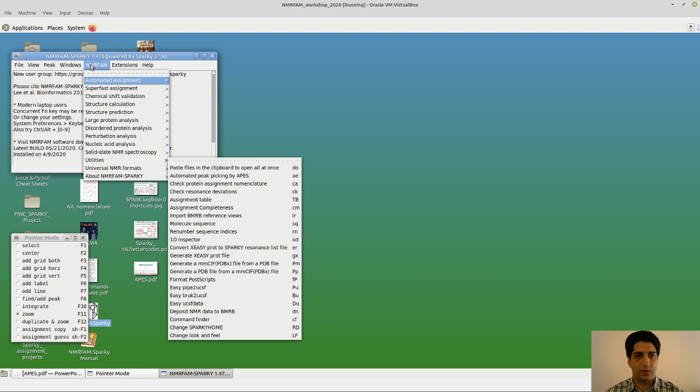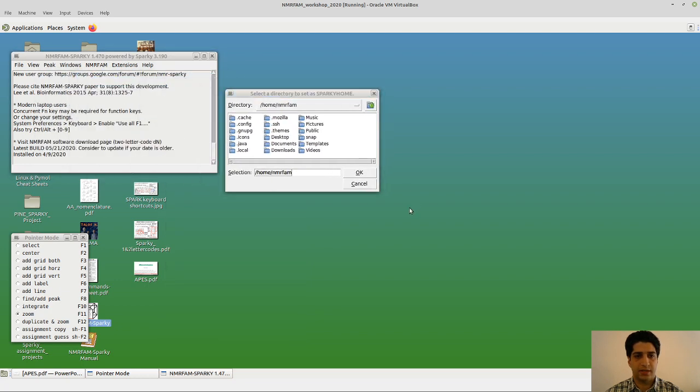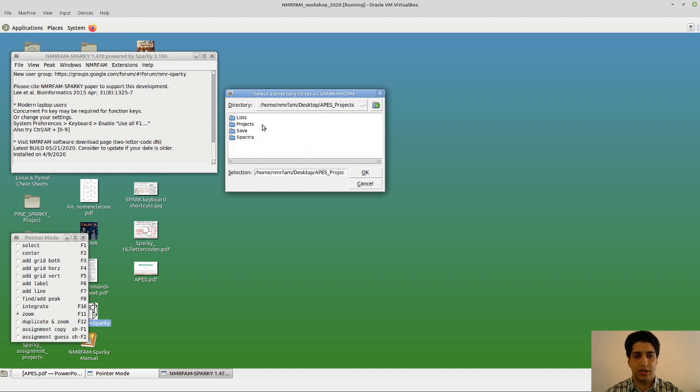So I went to NMRFAM, Utilities, and Change Home. Here it asks you for the address. We have the project on the desktop, so we go to the desktop. There is a folder called APES Projects. Click that, and that's it. Just click OK. So you're going to click OK when you are in APES Project.